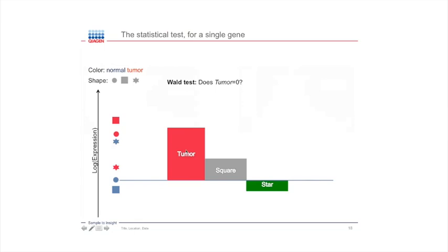And then you can ask, what's the chance that these effects really are as big as they seem? So you can have a fold change of 1.5, but if your uncertainty is so huge, then perhaps that's a fold change of 1.5, but it's not a really good p-value.